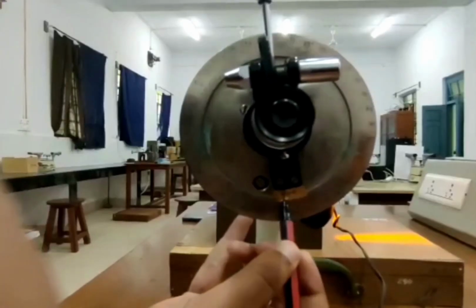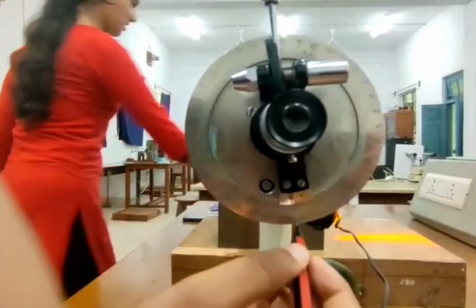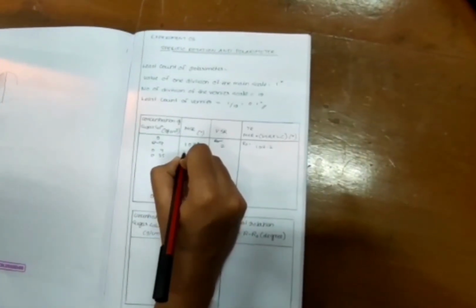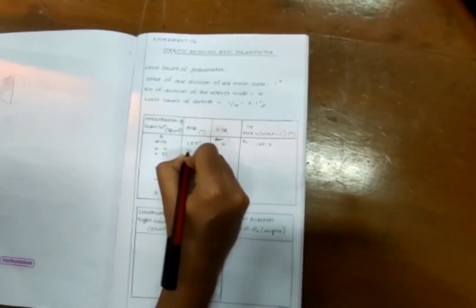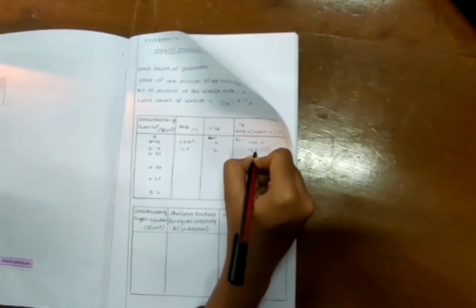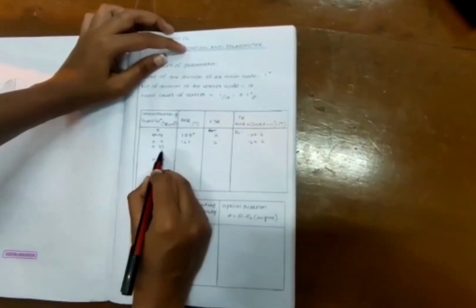Now we can note down these values. So the main scale reading is 167 and the vernier scale reading is 2. So the total reading will be 167.2. Moving to 0.35.